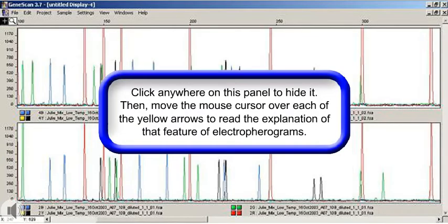Click anywhere on this panel to hide it, then move the mouse cursor over each of the yellow arrows to read the explanation of that feature of electropherograms.